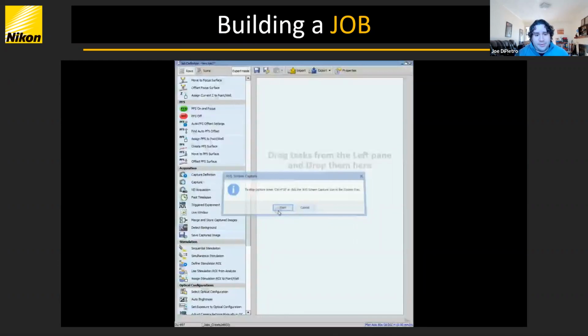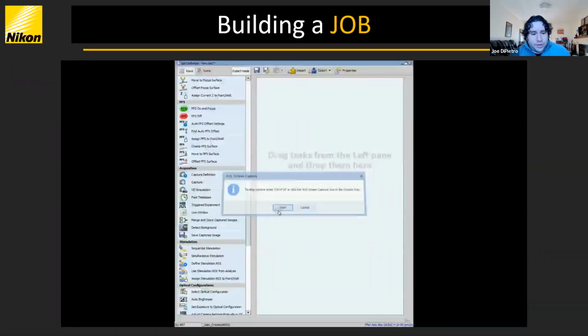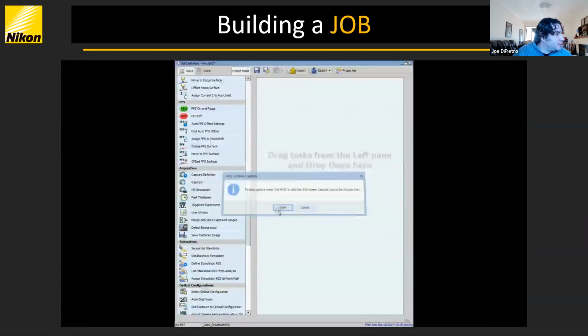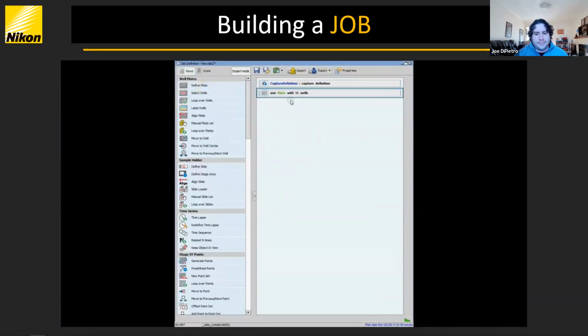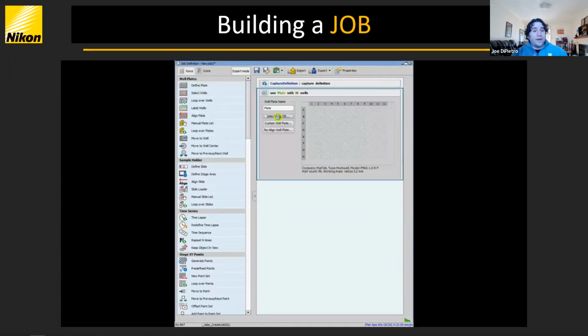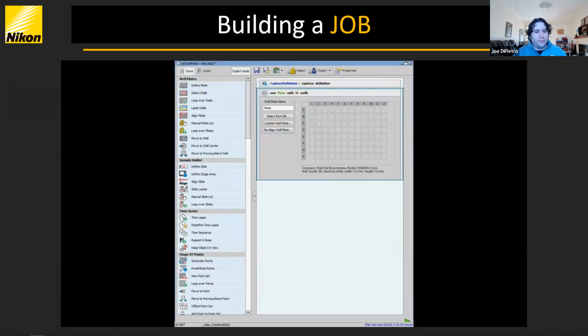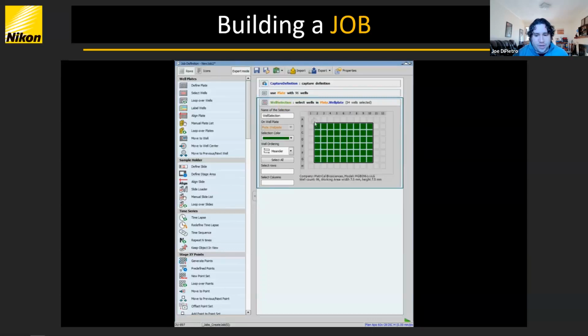It comes down to something that we call jobs. And let me see, I think I could play this here. So what we did is, in order to balance the ease of having a graphical interface with the infinite possibilities of doing programming, for example, we created this user interface called Jobs.